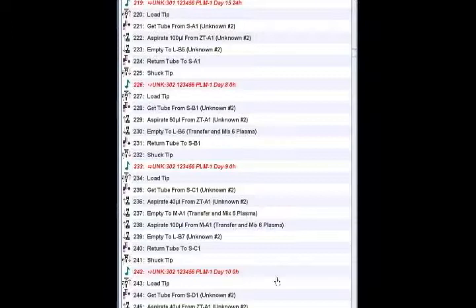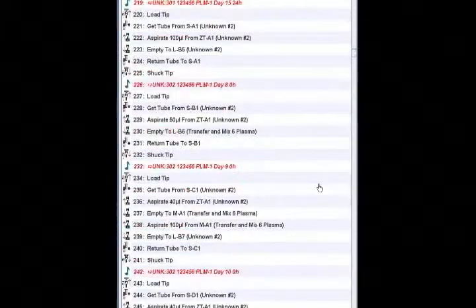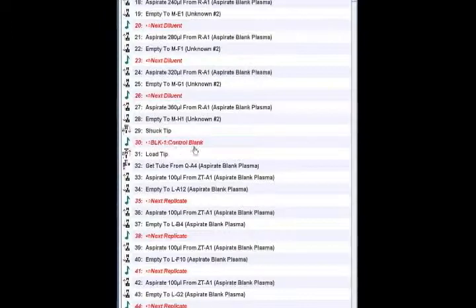There are some errors that the formatter cannot recover without operator's attention. This will be covered later. Looking at step 30, the diluent has been dispensed to all of the wells requiring pre-dilution. The formatter handles the blanks next.